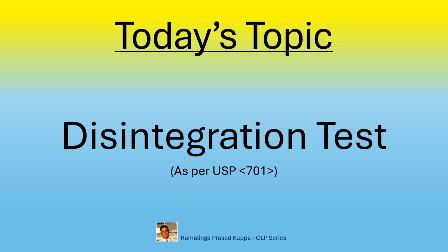Today's topic is the disintegration test as per USP General Chapter 701. This is one of the physical strength tests that are carried out on oral solid dosage forms. This will give you information on within which time the dosage form, the tablet or a capsule, will break into smaller pieces and get into the bloodstream for therapeutic activity.